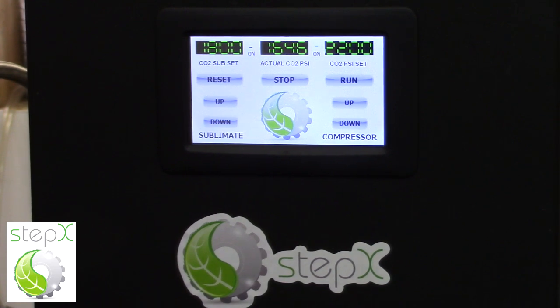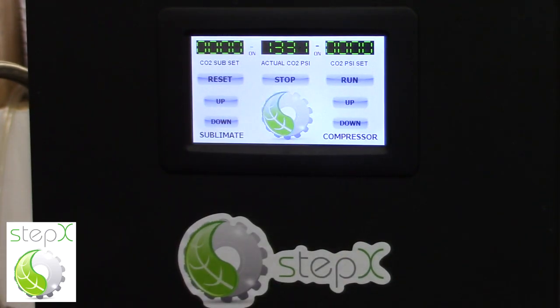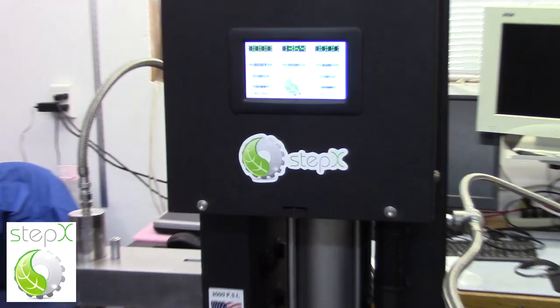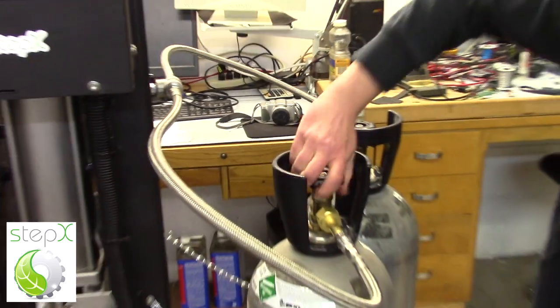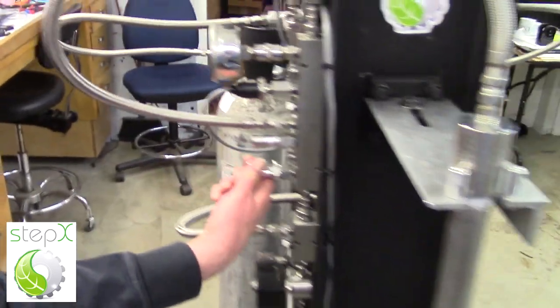Now that I'm at the end of my run, I come over to the compressor and press stop. I push reset to get the sublimator and the compressor back at zero, then press run again. Now the compressor knows it is no longer making compression, but it does get all the CO2 out of the system, sublimates everything else out through the reactor valve and into the collector. I also want to turn off both of my CO2 tanks, closing all the way. There is still some residual CO2 in the system, so I come around to the bleed valve and just let it go.